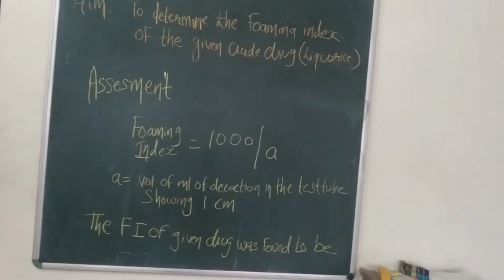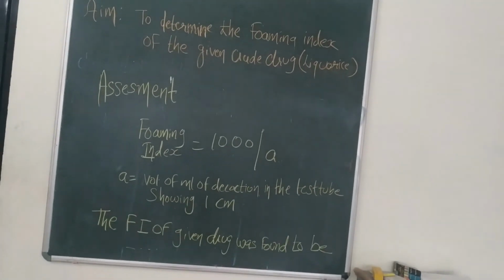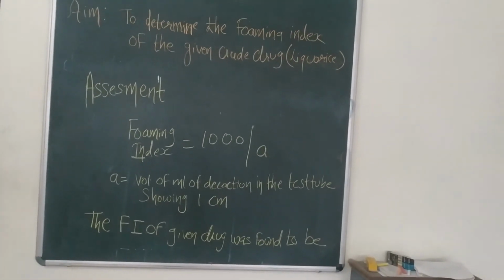Here, the sample given is licorice. We will also perform the same practical with the drug Shatavari, as I have shown you the powder of Shatavari too. Same procedure to be followed.